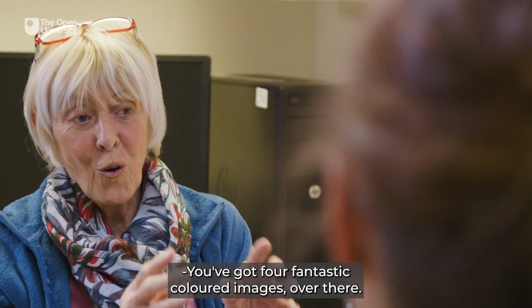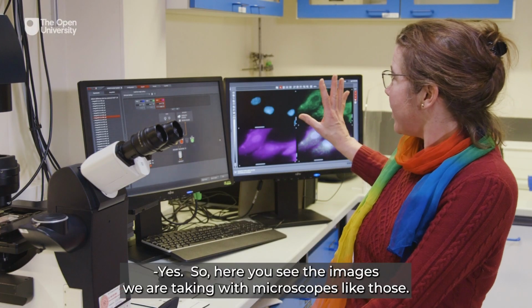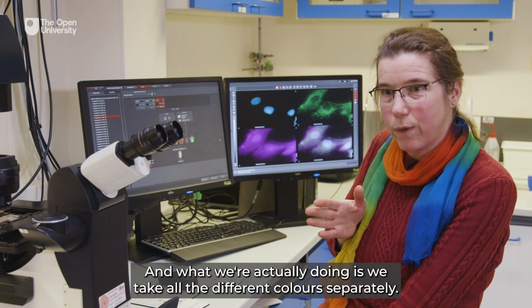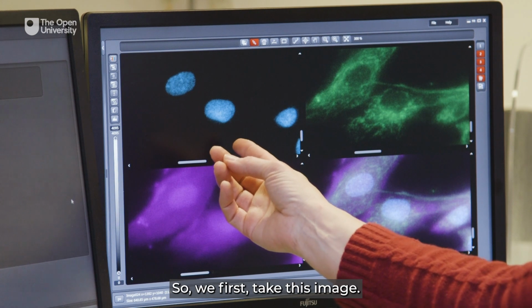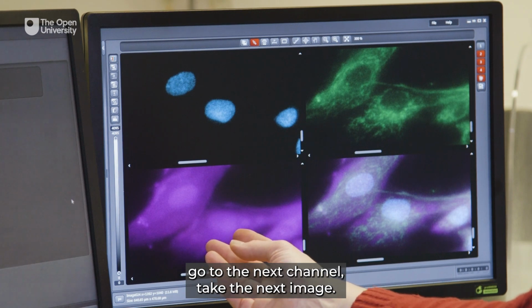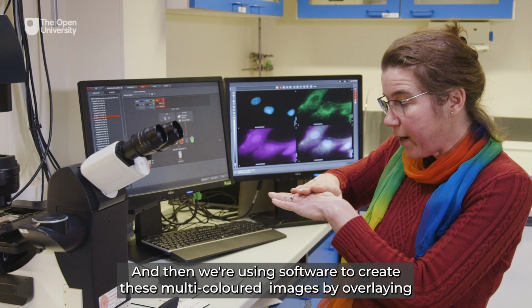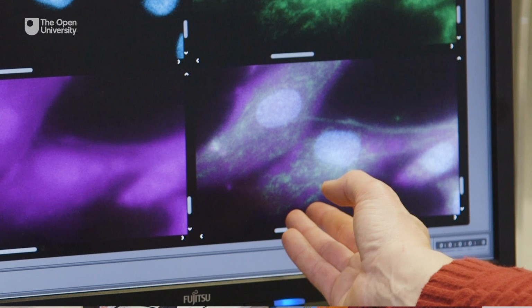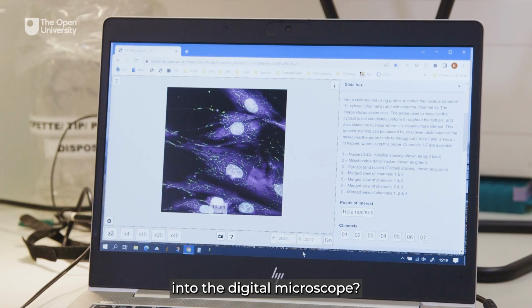You've got 4 fantastic coloured images over there. Can you talk me through them? Yes, so here you see the images we're taking with microscopes like those. What we're actually doing is we take all the different colors separately. So we first take this image, then we go to the next channel, take the next image, go to the next channel, take the next image. Then we're using software to create these multicolored images by overlaying all the 3 individual images. So how does all of that translate into the digital microscope?